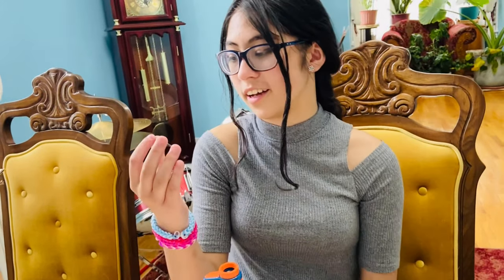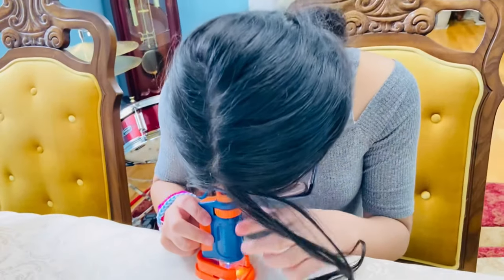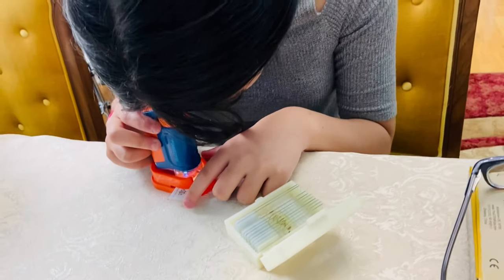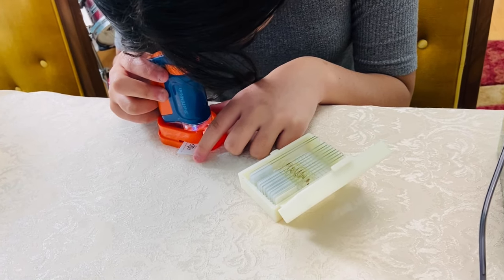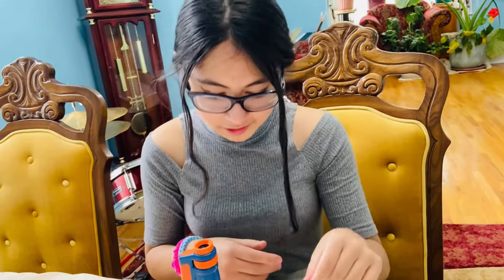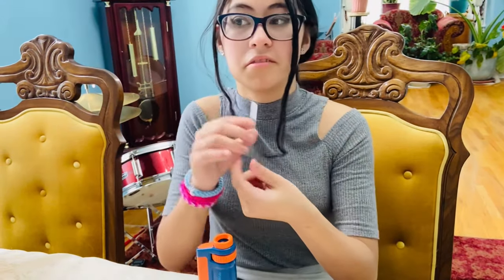I'm going to look at the honeybee pollen leg — just their leg there, you can check it out. I'll take my glasses off. It's very tiny but it appears in a golden color. You can see the little legs. I'm going to check out the mosquito antenna next — it's very tiny too.